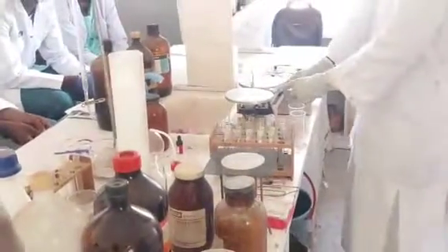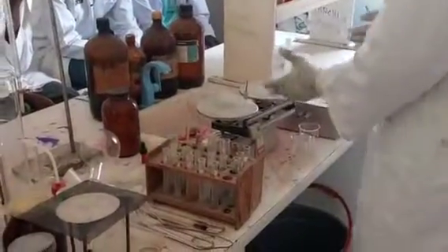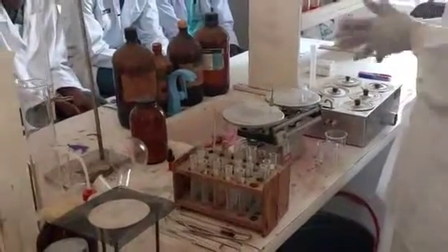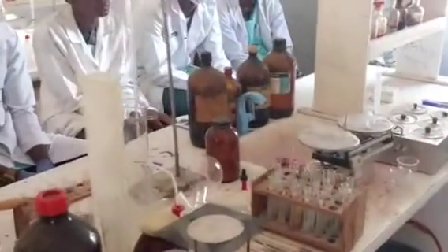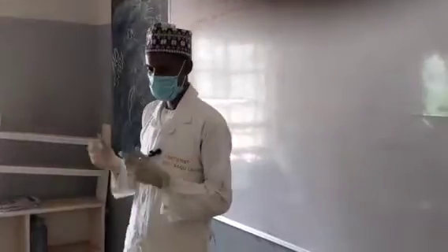So we use different types of instruments, and among them, this is also an instrument that can be used to measure out direct mass. We have the modern types, so many differences. So this is one among what can be used to measure out solid or liquid reagent, to measure the mass. Is that understood? Yes. So before we call it a day, any questions from you?